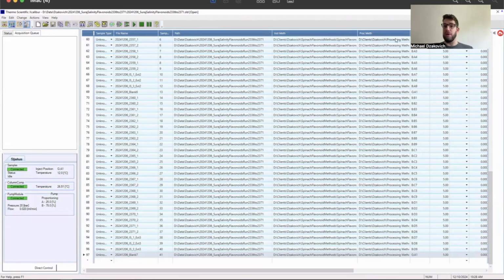And one thing that's really nice about mass spectrometry is that in general, because we're looking for a specific ion fragment pair, we usually just get a single peak, especially if we tell it only to look in a certain time frame. As opposed to our system upstairs in the lab that uses a PDA, where we basically get an entire chromatogram and then have to know exactly which peak to look at to integrate. Here we usually get a single peak per analyte. There's a couple of exceptions that I'll go through, but for the most part, it's pretty straightforward.